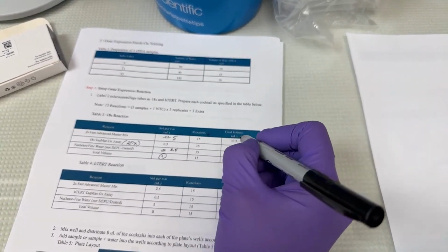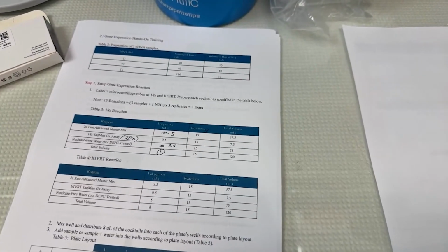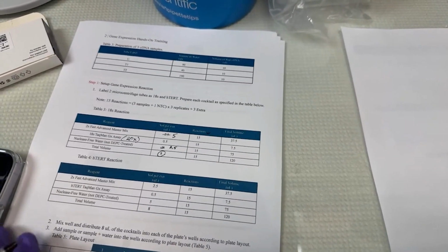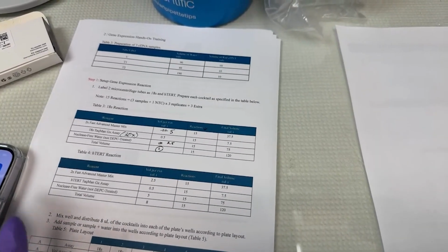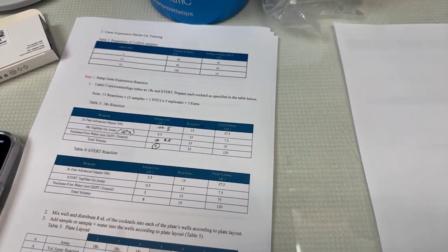So if we double check our math, those don't look right, so let's fix it. Always have a calculator available when you're in the lab.